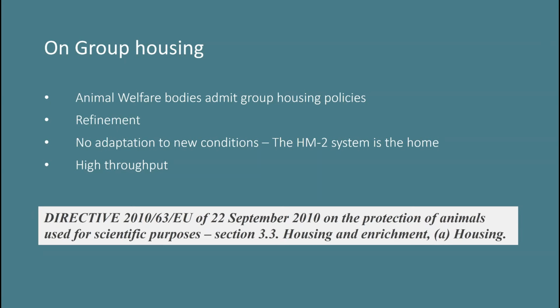When we're talking about rats, the lean rats, we typically see 4 animals per cage. Bigger or obese rats up to 800 grams is 3 per cage. Compared to single or pair housing, you really get a shorter timeline in your project due to habituation and more animals per equipment.